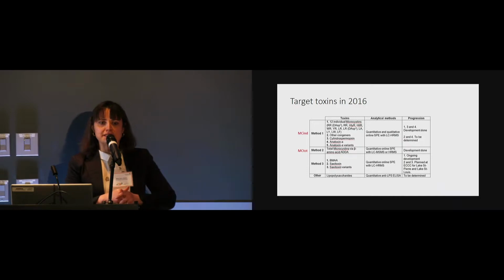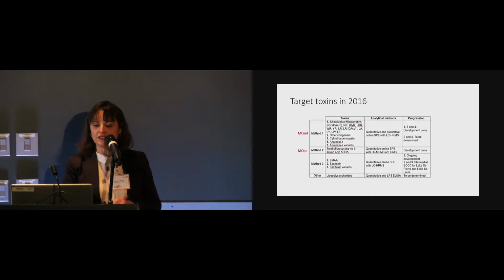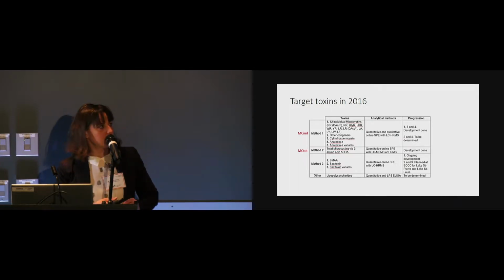So today I will be presenting you an overview of the cyanotoxin analysis since the beginning of the project. So when we started the project in 2016, we had planned to do analysis of individual microcystins.